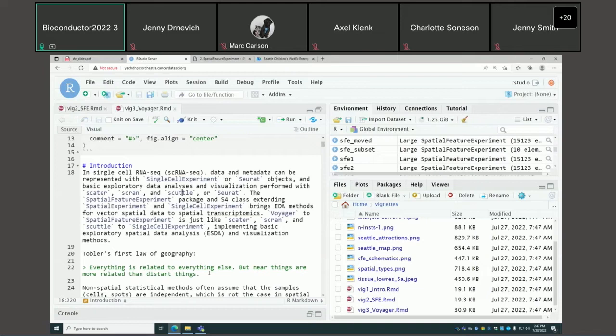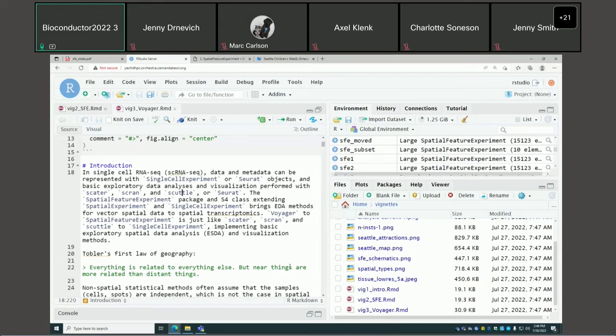With some ideas about the SFE object, we can proceed to perform analysis. If you've worked with single-cell RNA-seq data using SingleCellExperiment, you have packages like scater, scran, scuttle for basic analysis, QC, and visualization. For Seurat, it implements both an object and basic analysis and visualization methods. We aim that Voyager is to SFE just like scater and scran are to SCE.